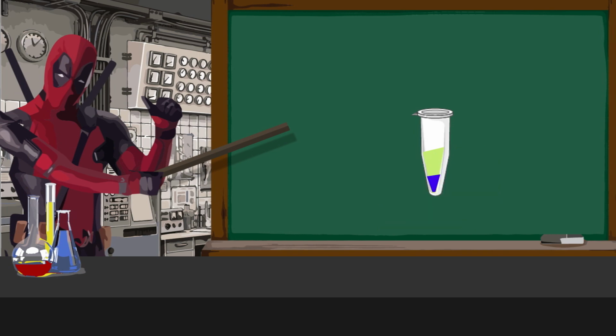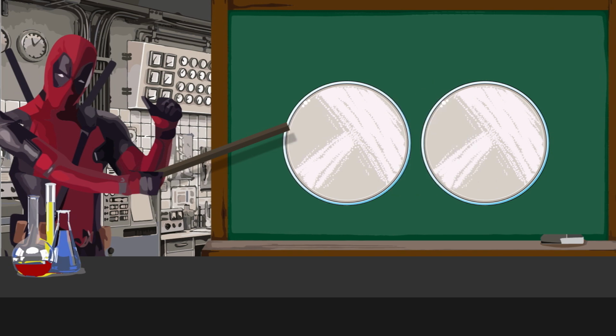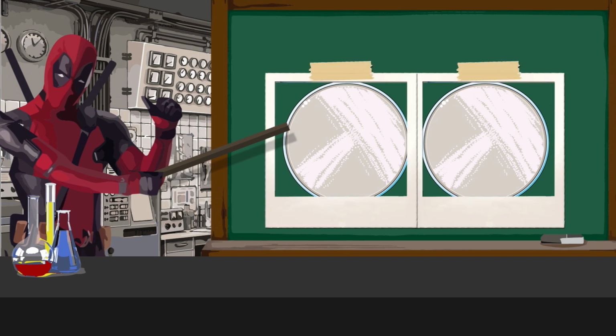After that, add 1 milliliter of the broth to the tube containing the E. coli and plasmid, and transfer it to a shaking incubator for 5 minutes. After the 5 minutes, pick a colony from your plate and use a cell spreader to streak 50 microliters of bacteria onto each LB plate. Then incubate overnight at 37 degrees Celsius. After overnight, return to take pictures and determine which LB plate contains ampicillin and which one is without ampicillin.